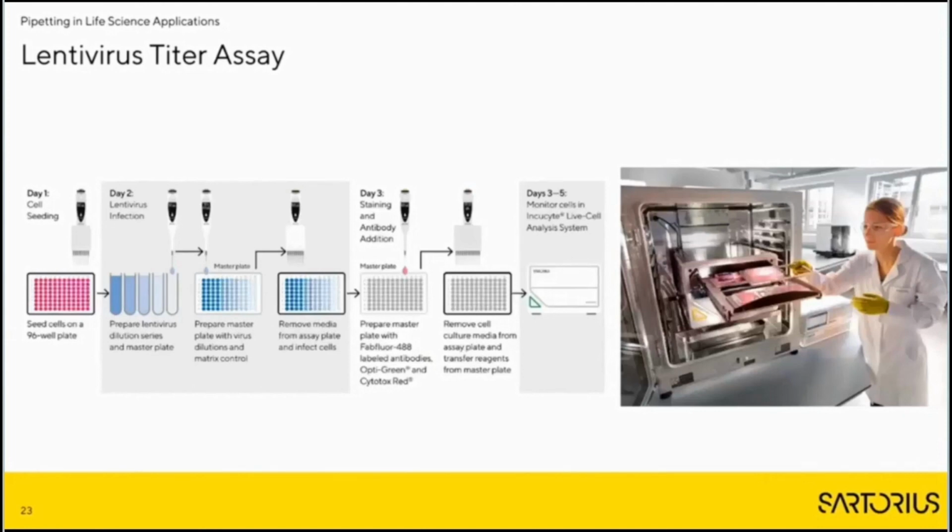So pipetting practices can greatly affect the reproducibility of sample preparation and ultimately the outcome of, for instance, cell-based assays. In cell-based assays, as an example here, removing the cell culture media from microwell plates with too high speed can cause cells to detach, for instance. Details regarding how pipetting steps should be performed are often omitted from published protocols, even though these can be very crucial for how reproducible the assays are in the end.